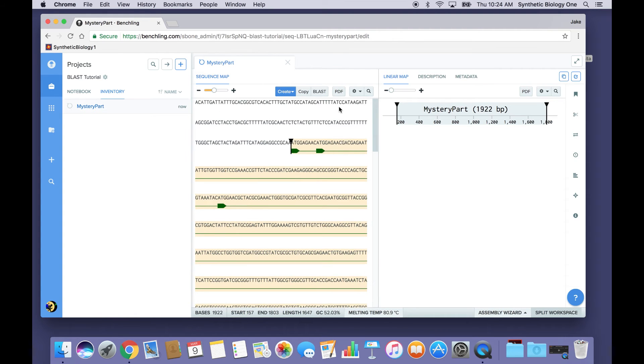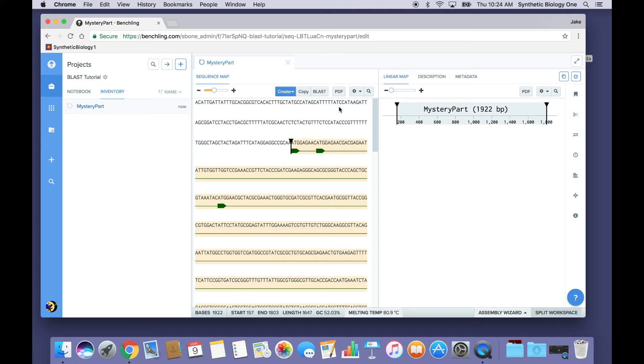So an ORF is a clue that a DNA Sequence might code for a protein. And a protein is going to have certain functional features that are going to give us a clue about what the purpose of this particular synthetic DNA Sequence is. And so in order to find that protein, we use BLAST.